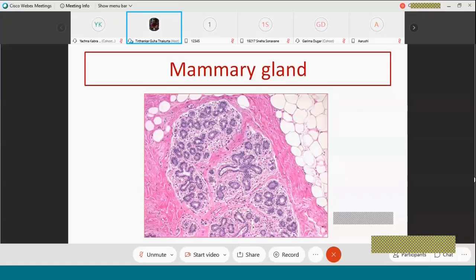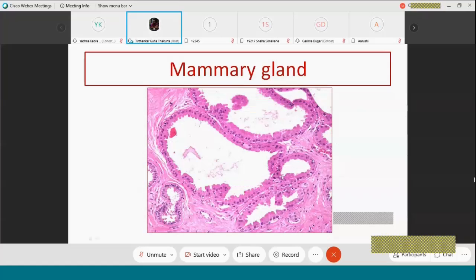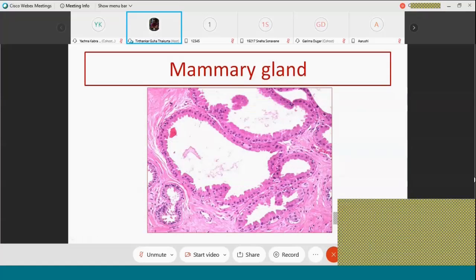In case there is a confusion, if you look very carefully into the gland or in the high power, you will see, look here, the end of the cells are elevated. Can you notice that? The ends of the cells are irregular, as if they are projecting into the lumen. They are not smooth. There are some glands which perform their secretion by pinching out a part of the cell membrane. That is called apocrine gland.